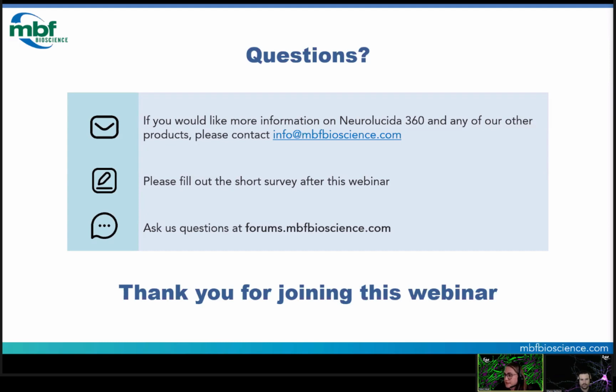All right. We had another question from John. I use both NL360 and VL360. Will this batch functionality be in VL360's next release too? We'll clarify first, VL360 stands for Vesselucida 360, which for those of you who are here and don't know about, it's our vessel tracing software and analysis software. And the answer to John's question is yes.